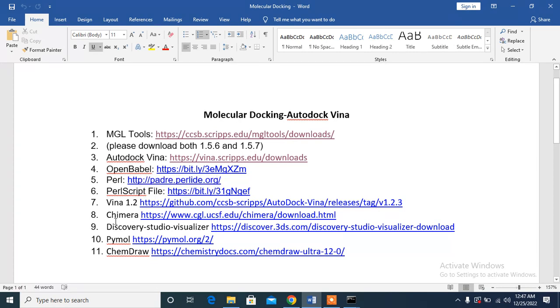And Chimera, this is the software where I will make my protein. I will prepare my protein over here in the Chimera. Let me show you.